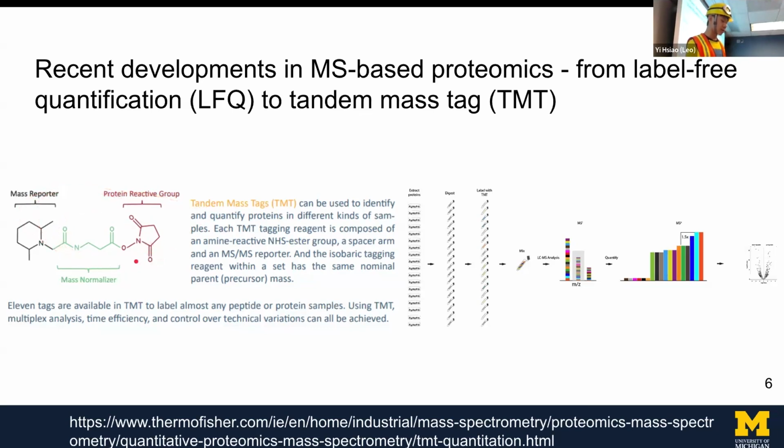Since this chemical structure is well designed, when it goes into MS1 and MS2, they will separate apart, and you can use one of the groups as the quantification value to reflect how much protein you have. But that's just a general introduction of this technique.